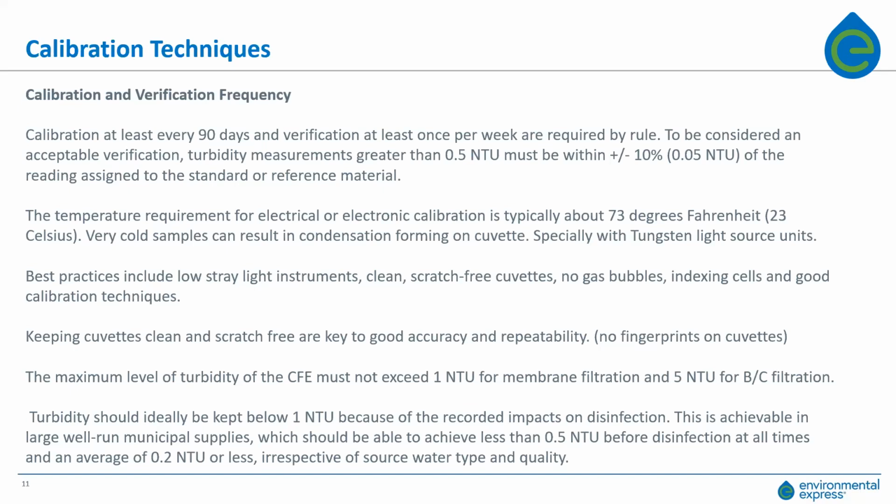The temperature measurement for electrical calibration is typically 73 degrees Fahrenheit or 23 degrees Celsius. Very cold samples can result in condensation forming on the glass cuvette.